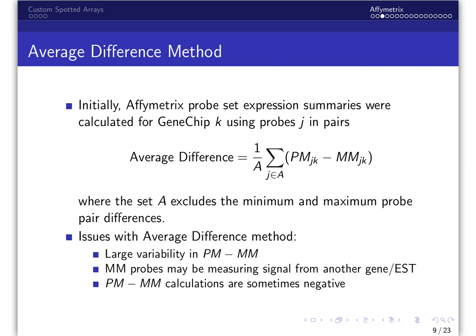To circumvent this problem, various researchers suggested that a constant value be assigned to all probe sets having an expression summary below some threshold. Problematically, when assigning constant expression values to some probe sets, this reduces the variance beyond what is real. Also, removing probe sets with negative expression summaries leads to the loss of information.